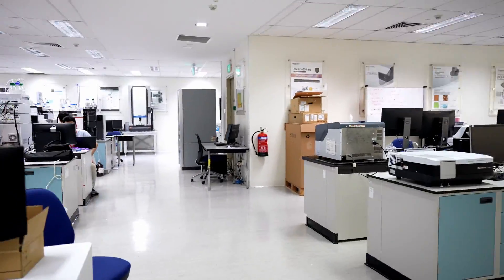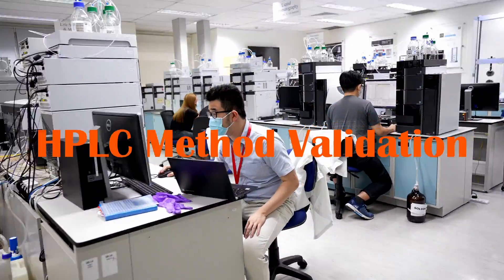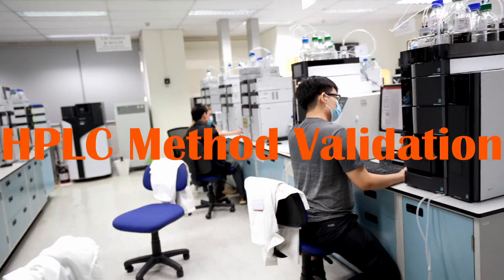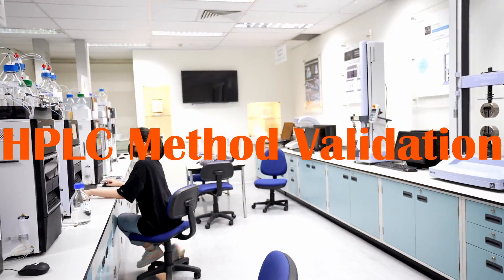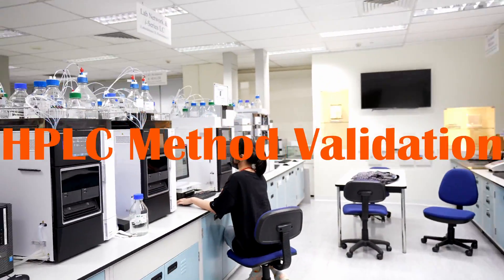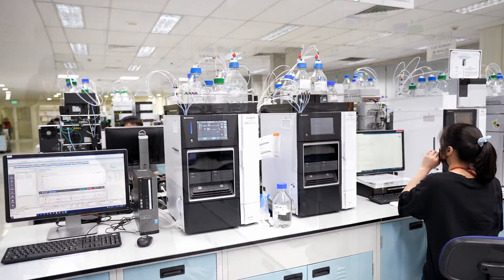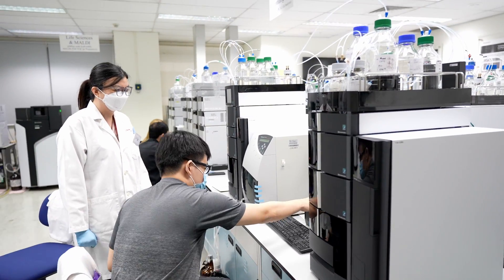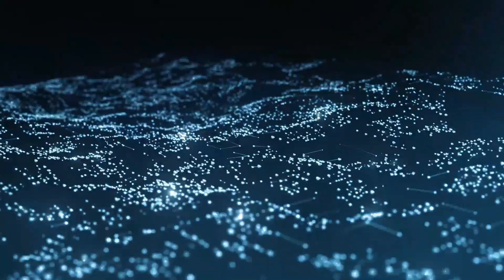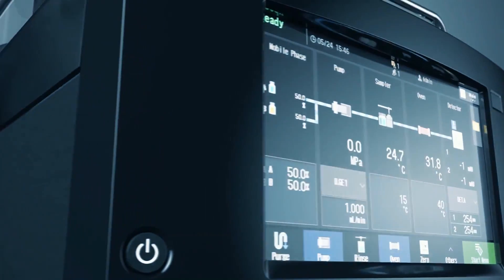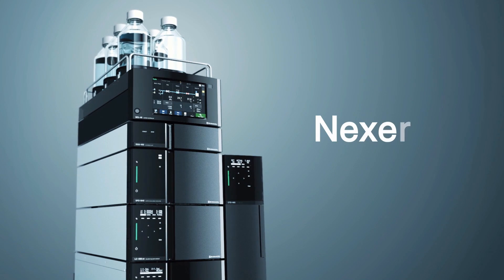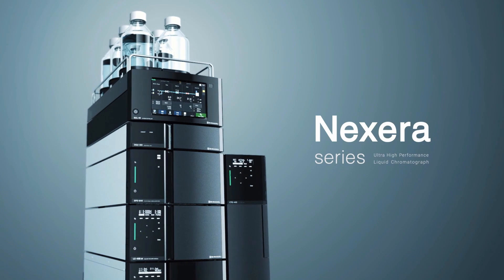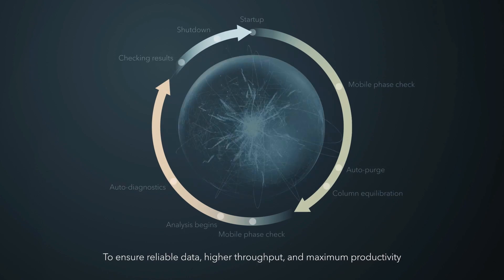Method validation for an HPLC method is required in a lab and is common work of a chemist. Shimadzu Nexera and i-Series HPLC system with LabSolutions workstation enhance HPLC method performance, thus making method validation work at ease.